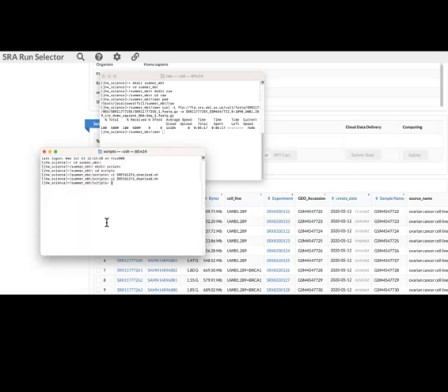Okay, so if I want to run this shell script, all I have to do is press sh and the file, and it will run the file. At this time, the way that I have the shell script written though, it's going to download each one of these files into this script folder.